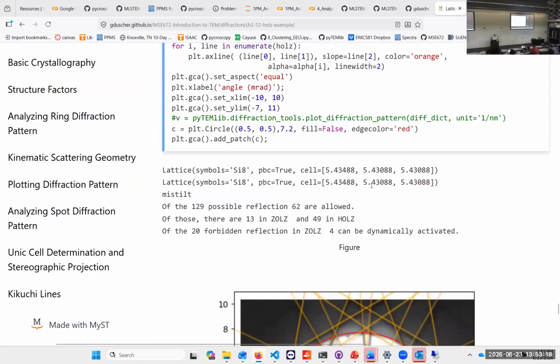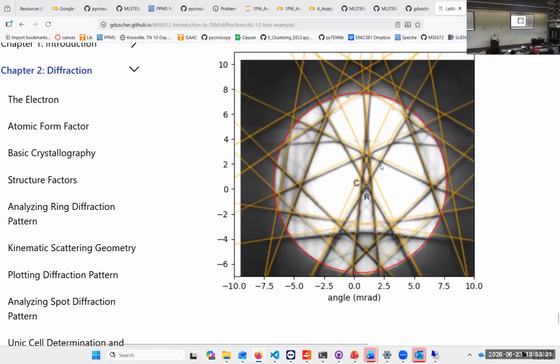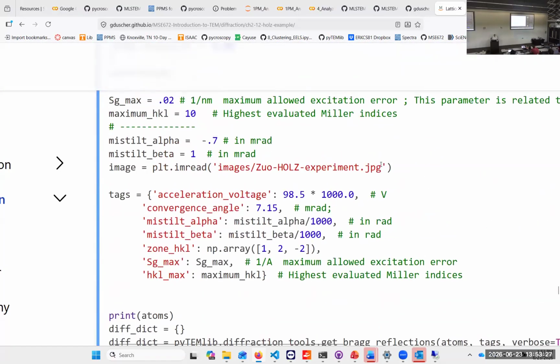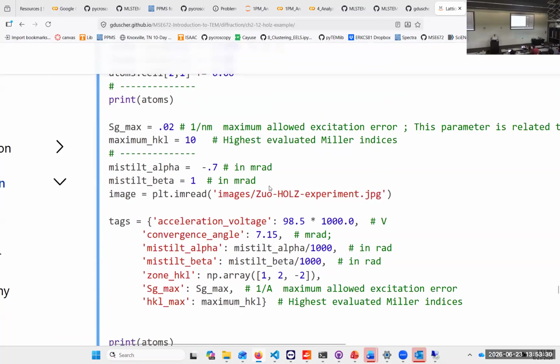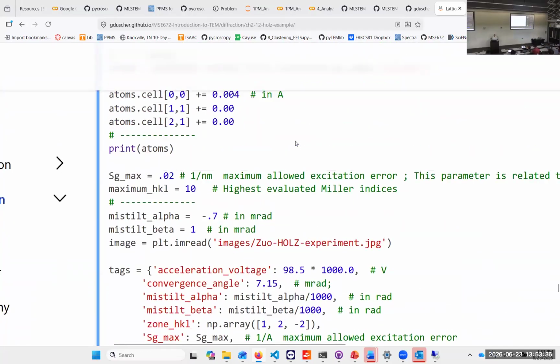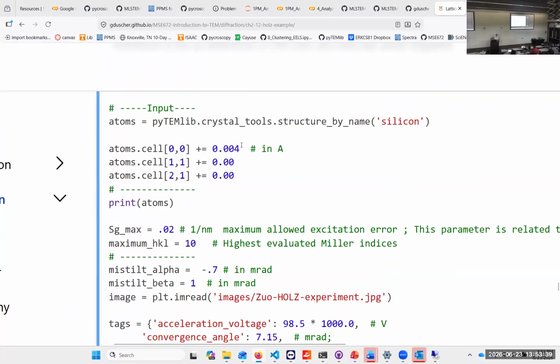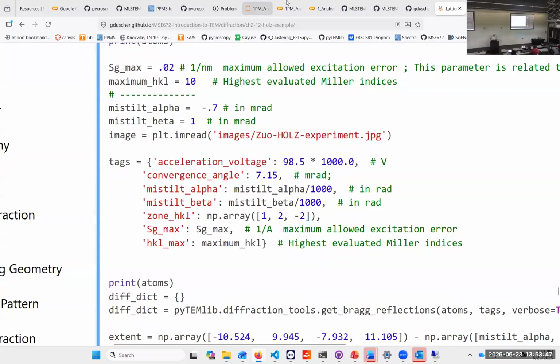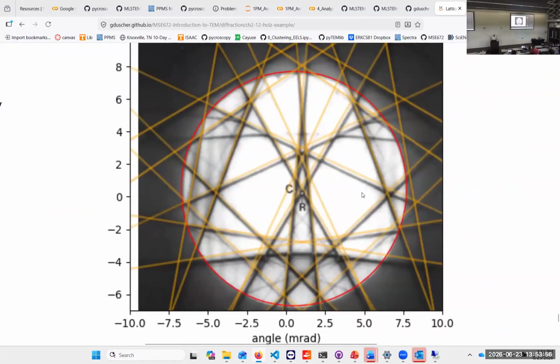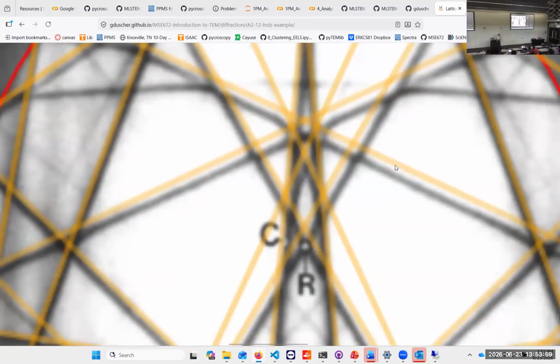The deformation of that, how much did we at the time deform that? Yeah, here. 0.4 picometer, 0.004 angstrom. And things fall apart.